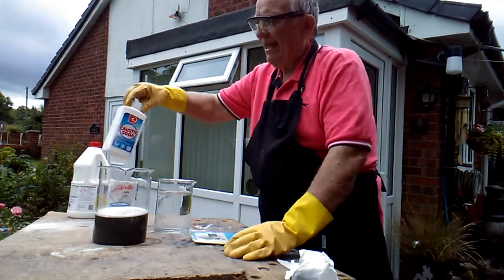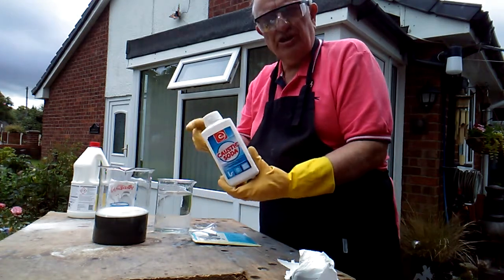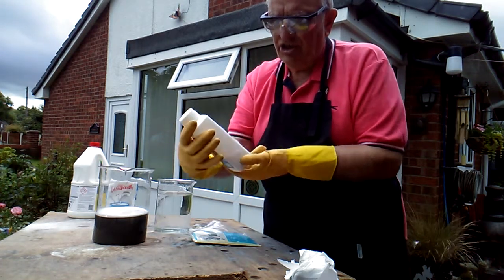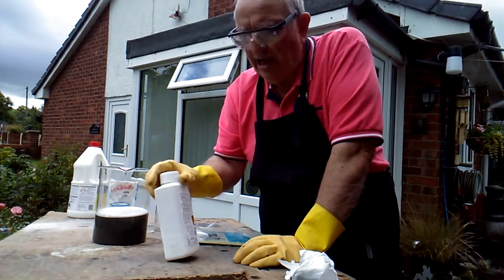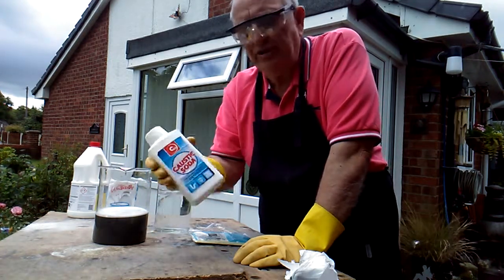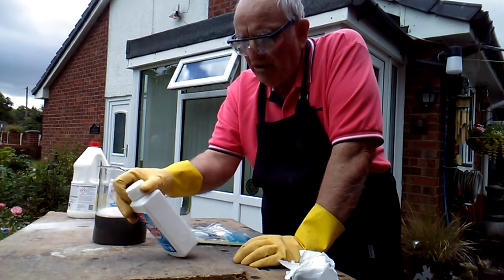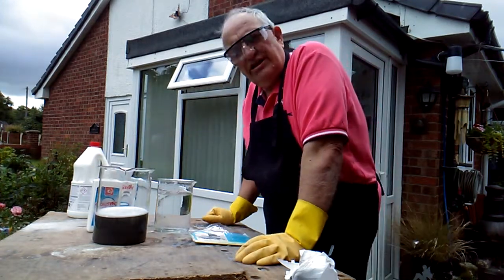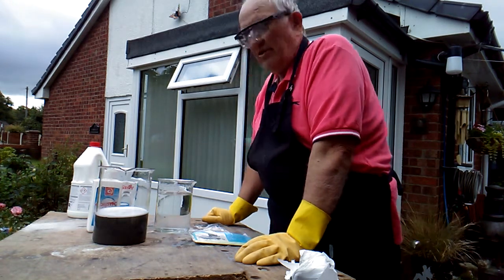The next thing to do is to add what we call caustic soda in England — sodium hydroxide. Some people call it lye; over in America they call it lye, over in England we call it caustic soda. Add caustic soda to convert the silver chloride into some form of silver metal. I've got pure sodium hydroxide here in powder form — don't get the liquid kind because that might have other things in it. I'm going to put that in and that should convert my silver liquid into silver metal.